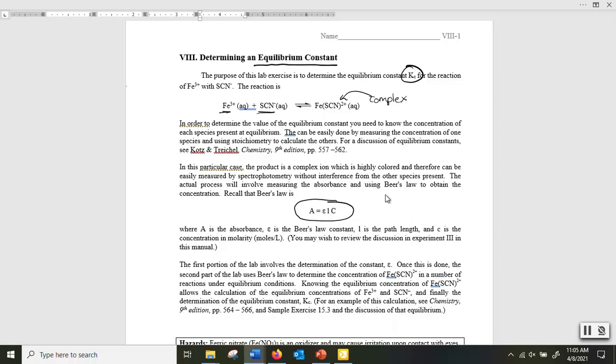And remember what you did first was develop a standard curve where you made a set of concentrations, which went on the x-axis, and you measured the absorbance of the solution on the y-axis. So this concentration set, you made the solutions, and then you measured the absorbance for each of them.